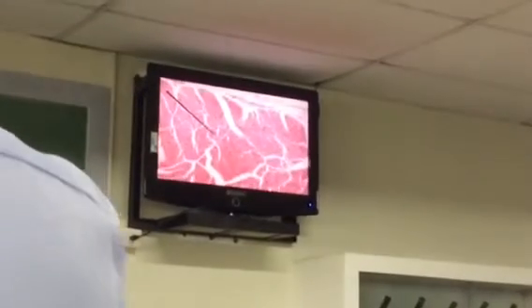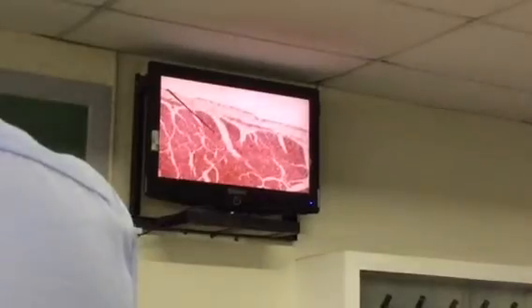You will review your heart. So you have your 3 layers of the heart. This is the lumen in this area. And then the outermost wall of your heart will be found in this area. So yung sa labas, tapos sa loob ng puso ay dito.